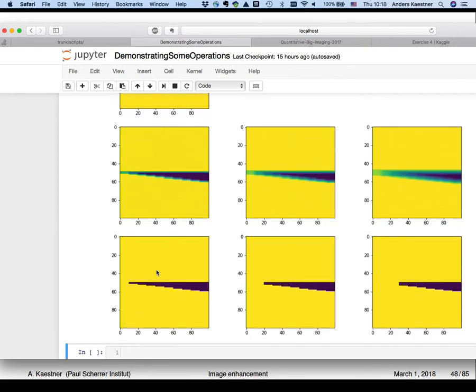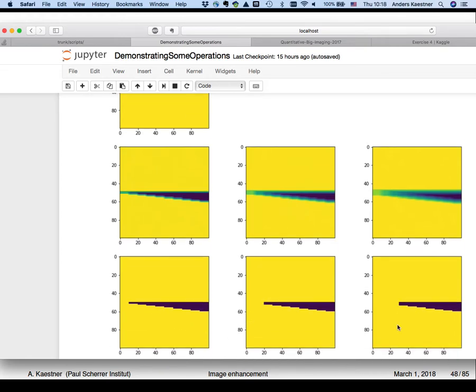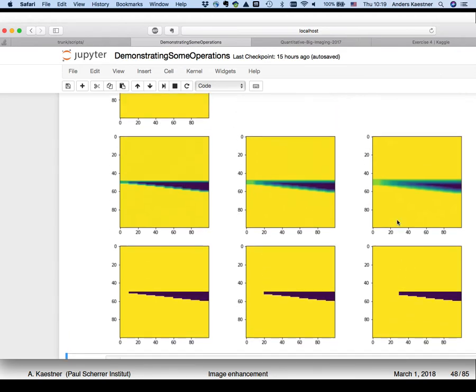And then I try to segment it, and the first difference you can see is that this bridge here has been made, and it's even more and more depending on the filter kernel size. So you see that there is an effect between filtering and segmentation for performance afterwards.